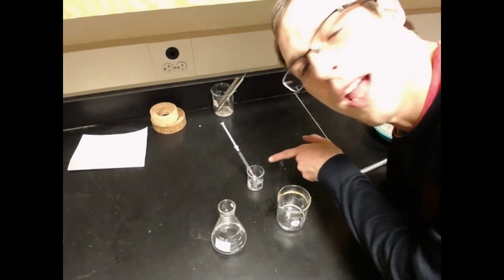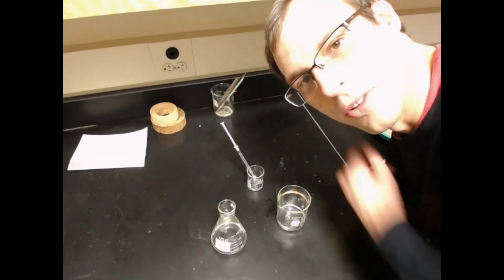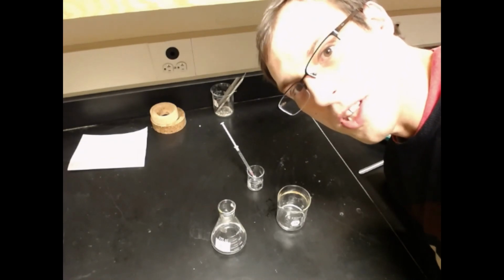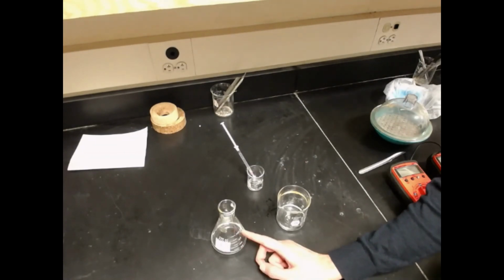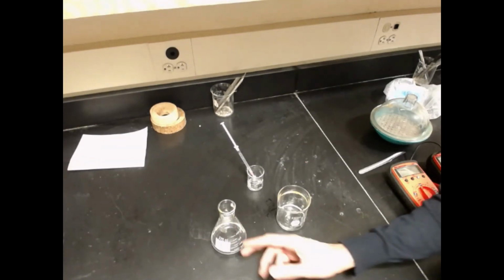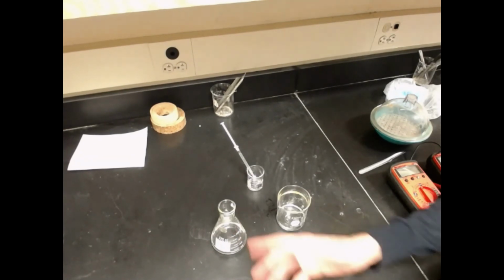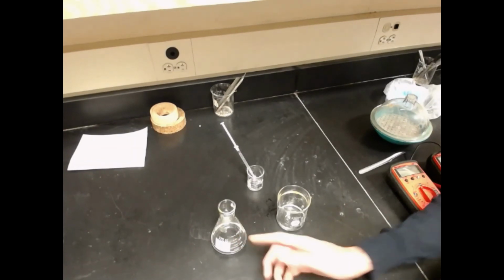And then back here we have sodium thiosulfate that we're going to be adding as a way to keep track of the reaction. So let me explain what's in the beakers when we mix them together and watch the reaction happen. This Erlenmeyer flask has our potassium iodide, one of our reactants, as well as a small amount of EDTA to complex any metal ions that are present. Potassium nitrate makes up the bulk of the rest of the solution, and that's to keep the concentrations of ions roughly the same between different experiments.